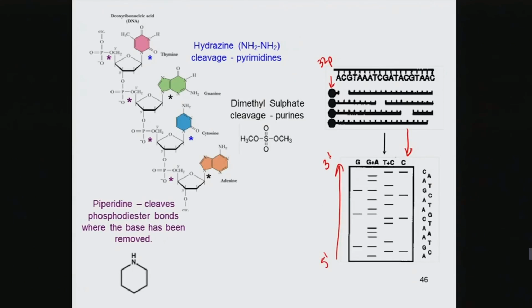And the problem with this, remember, hydrazine and dimethyl sulfate, is that sometimes it would cleave specifically for one nucleotide or non-specifically for both. So how do you read this? You would start with the furthest migrating band. So we can look in this column. We can see the treatment was non-specific for either A's or G's. But if we compare it to the G column, we don't see a G. So basically, this band will represent A, and we can name it an A, an adenosine nucleotide. So that's the first base in the sequence, which we see up there.